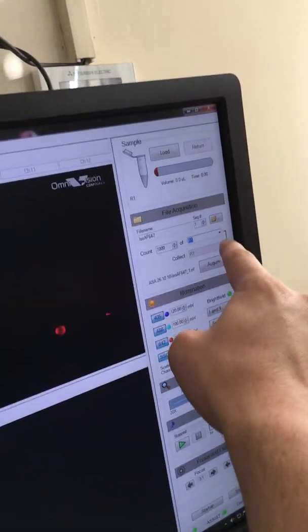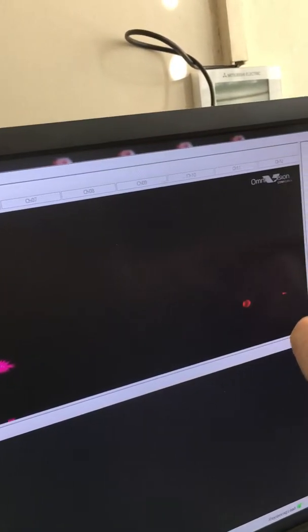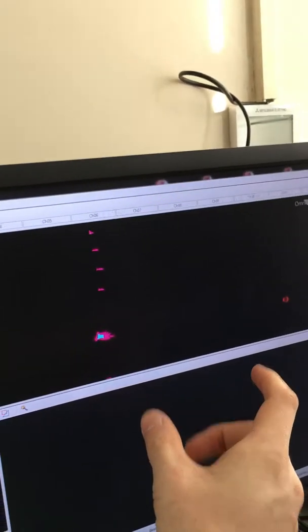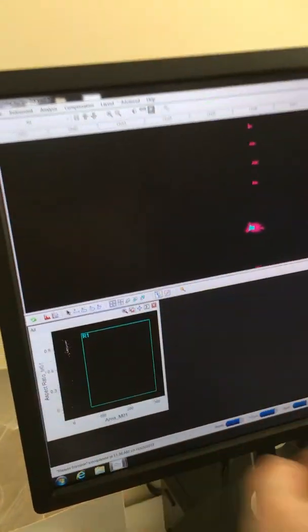You can also see that little line there. Click that, and that breaks it apart. So you could say count 1,000 of, say, a population that you know is positive, where you want to record a minimum of 1,000 of those. You press count 1,000 of those, but collect everything in all your cellular events, so later you can edit that.